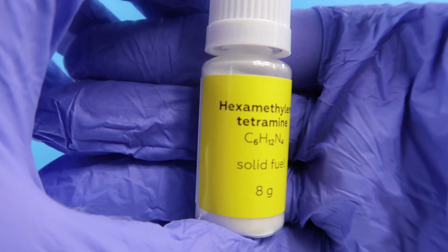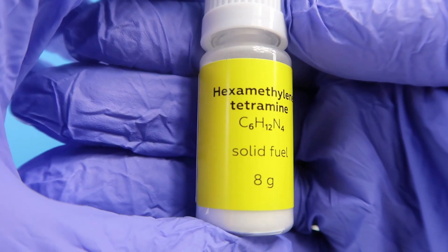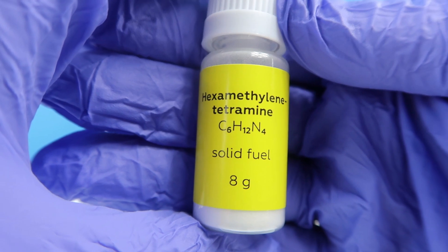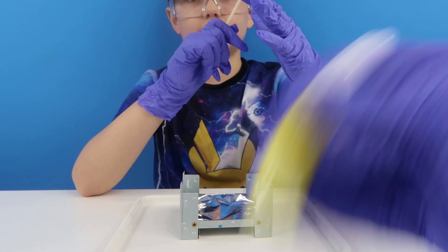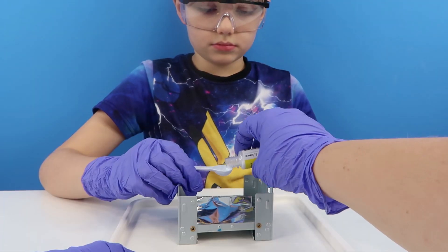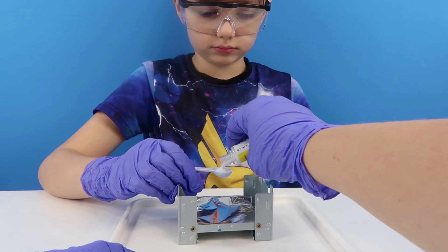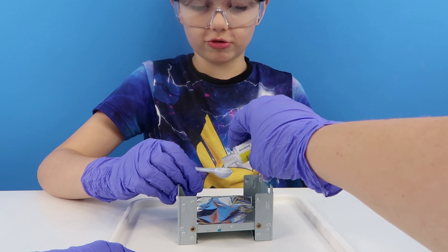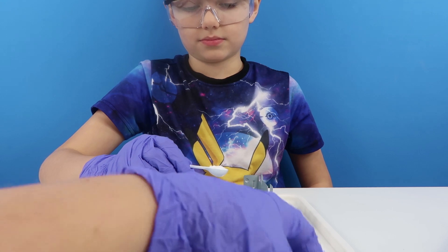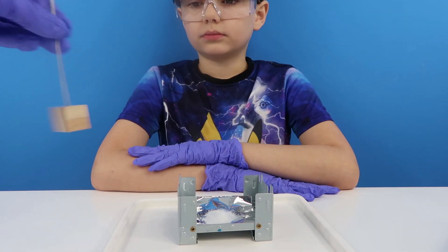Let's give it a go though — Hexamethylene tetramine. Hexamethylene tetramine — tetramine or tetramine? Not sure. Put one big spoon of this onto here. That looks like sugar or salt or something like that. So pour that onto the foil.